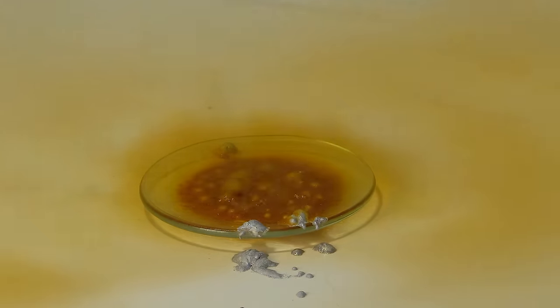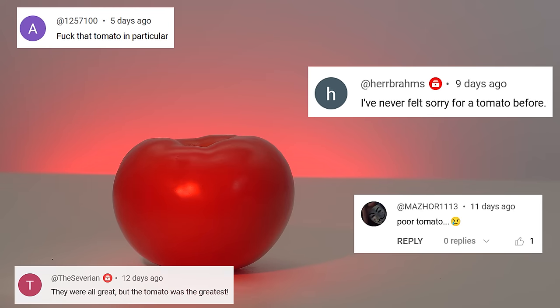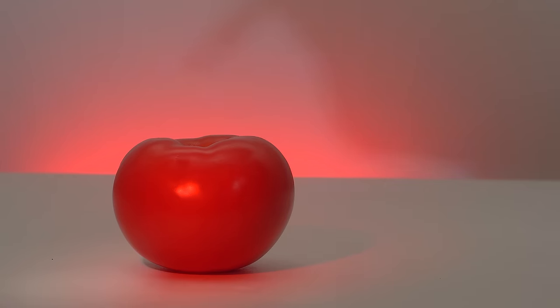As you noticed, the rule that a very strong oxidizing agent and a very strong reducing agent react predictably and very violently does not always hold true. Judging by the comments on the last video, you enjoyed the reaction of injecting into a tomato, so I decided to repeat it with this alloy.